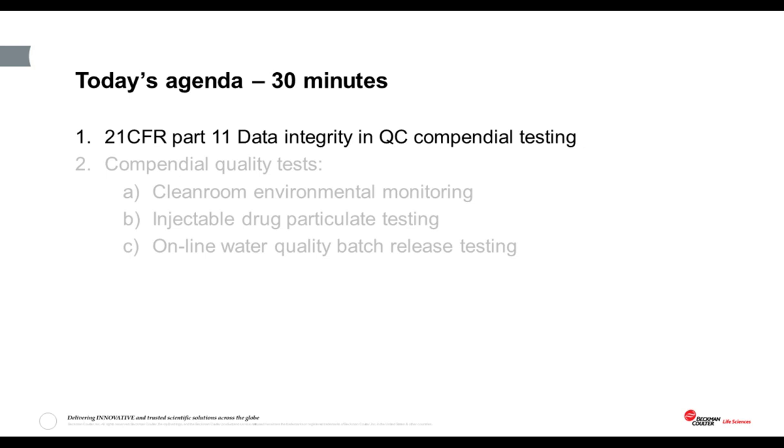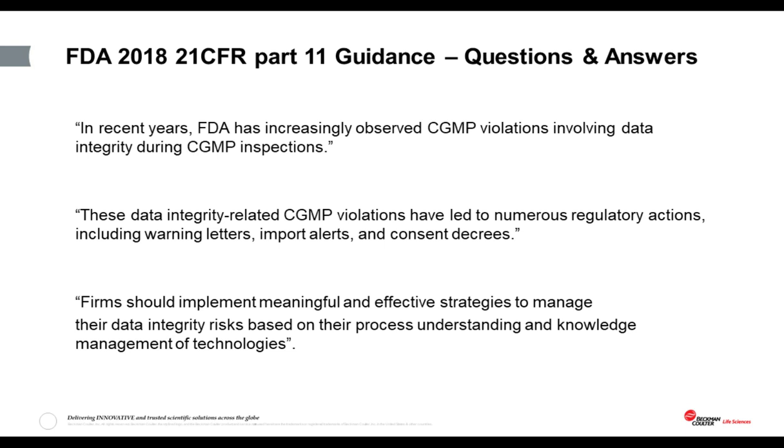So first, let's take a look at quality control testing and how this can be open to human error, unfortunately resulting in data integrity issues.